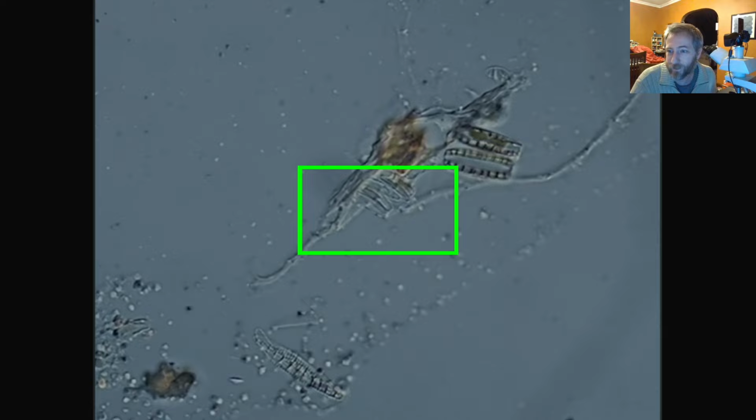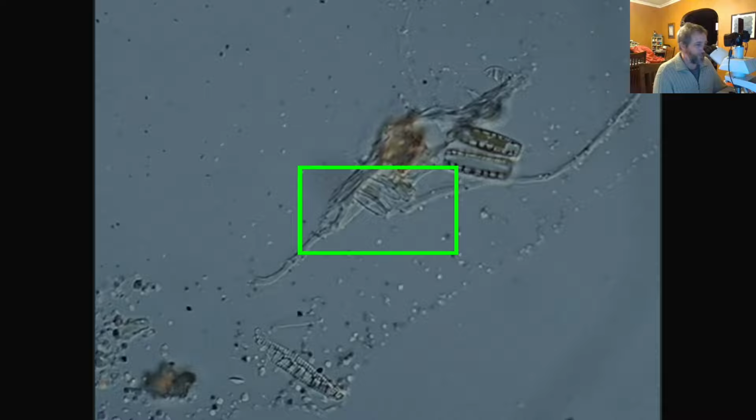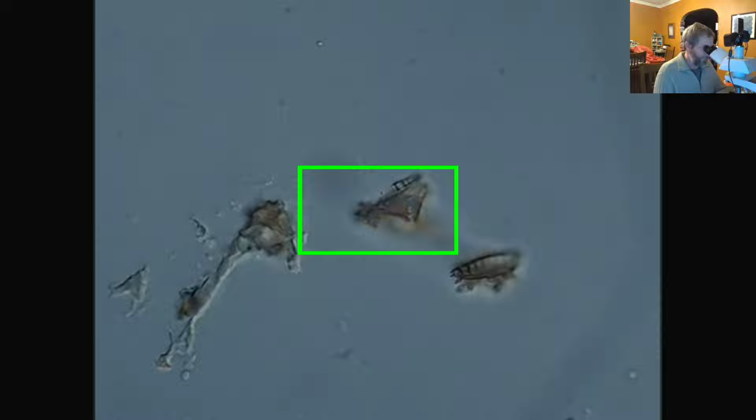You saw I made a post about getting some. Yeah, I need to get some material from this site because the diatoms that we're looking for aren't common enough. So we could look around for a while and not find any of them, which is what Rihanna did earlier in the week. And then I made a bunch more slides and looked around quite a bit until I could find some.